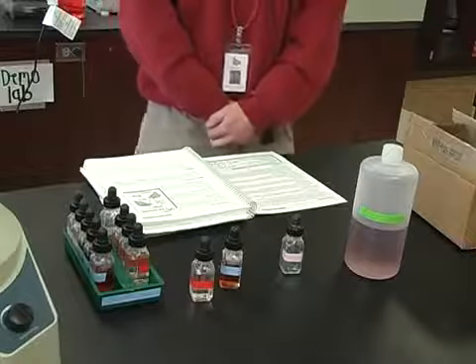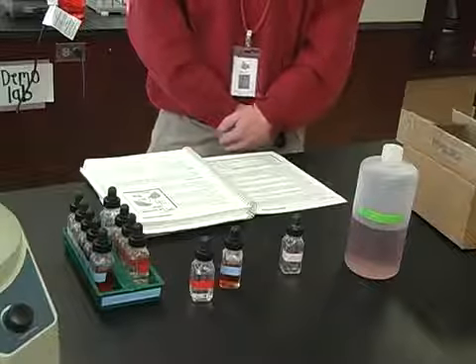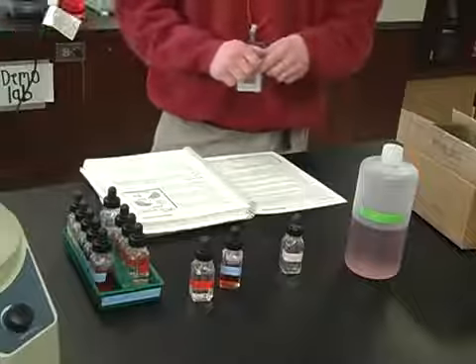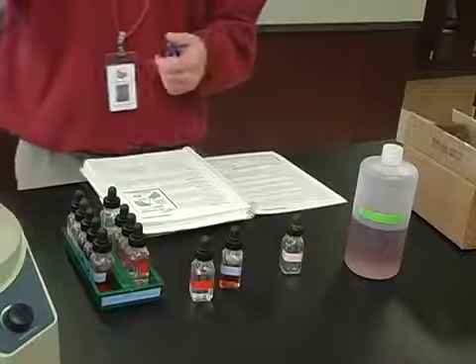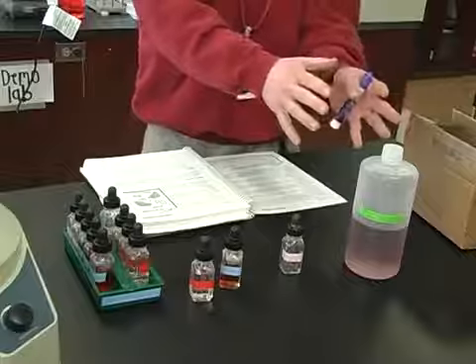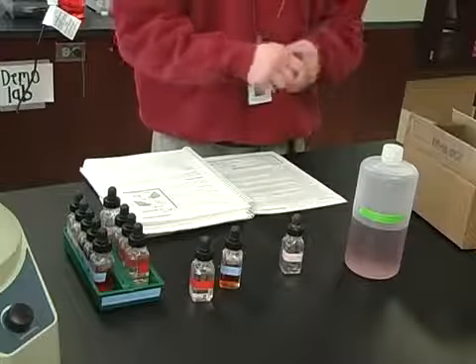Heating solutions. Frequently it will be necessary to heat a solution to speed up the reaction. Do not heat small test tubes over Bunsen burner flames. As a matter of fact, we'll only have hot plates at the different stations, and one of the first things you should do when you get here Tuesday morning is to fill up your beaker of distilled water, put it on your hot plate, a fairly large beaker, maybe about a 600 or maybe a liter beaker, and turn it on and get your water heating and boiling.